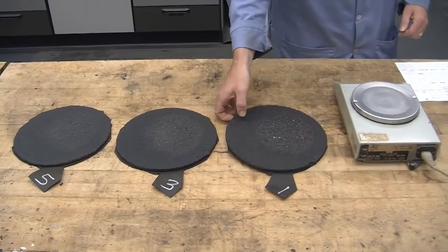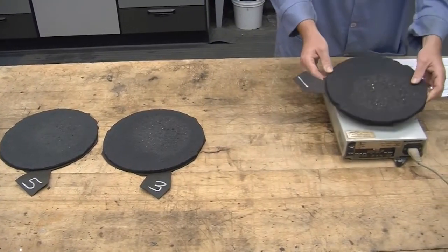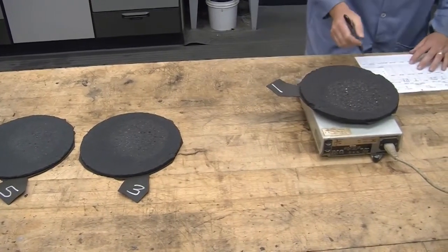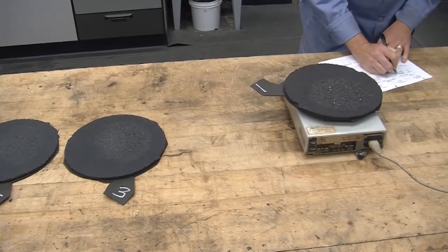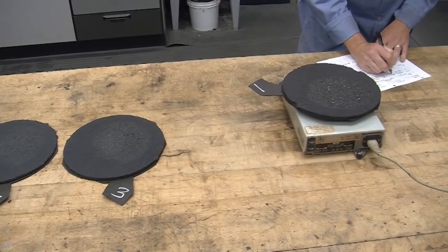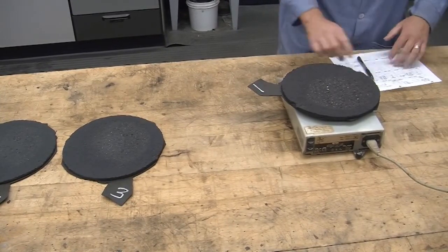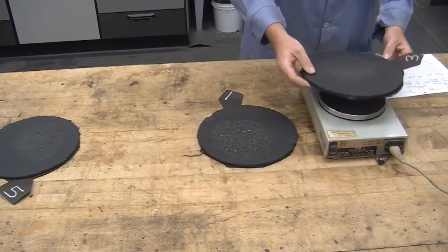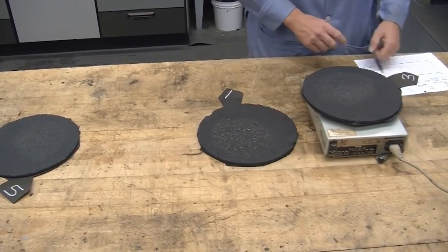Place the washed test specimen in the 60 degrees Celsius oven and dry to constant weight, which typically is 15 to 24 hours. The dried specimen is removed from the oven, allowed to reach room temperature, and weighed within 2 hours. The difference between this weight and the weight obtained after the first drying is the grams of abrasion loss. Calculate the abrasion loss per unit area by multiplying the grams of abrasion loss by the appropriate correction factor in Table 2.